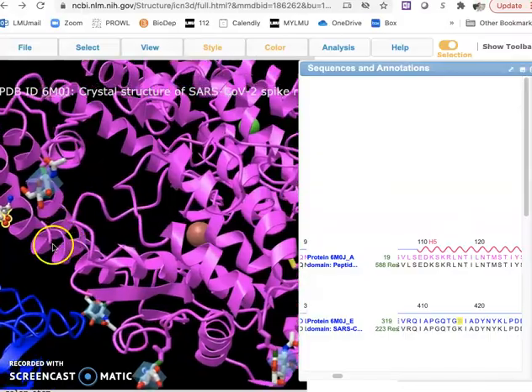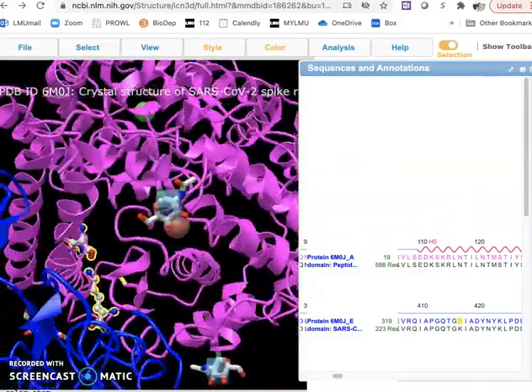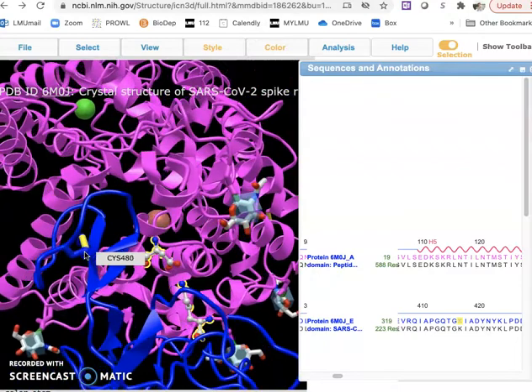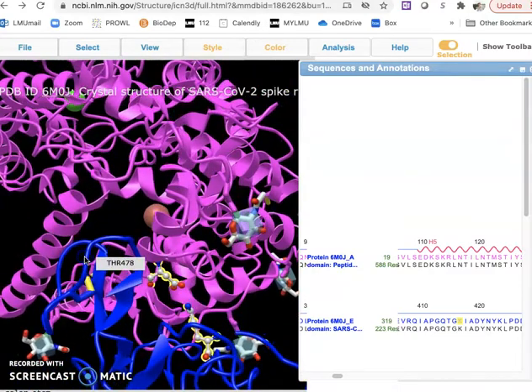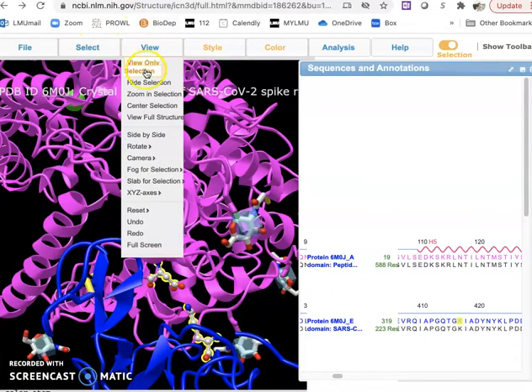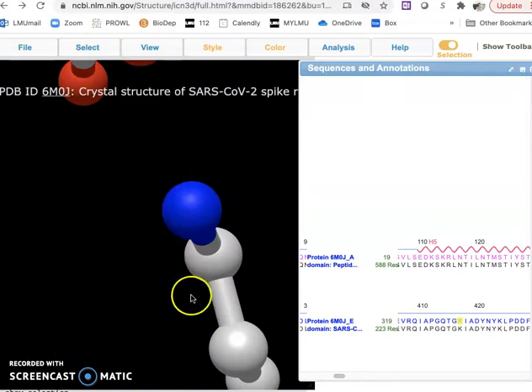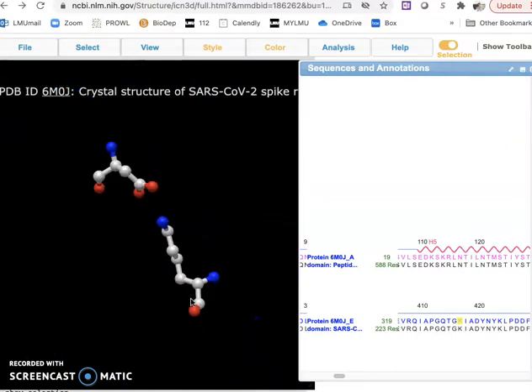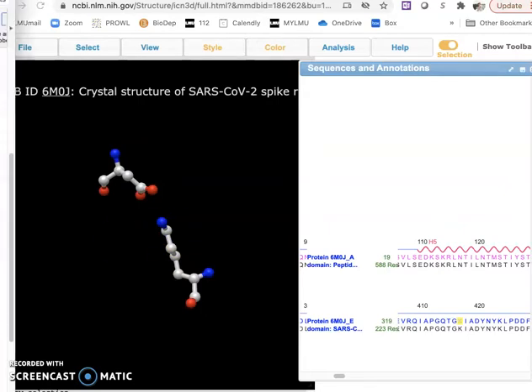I have a feeling I could see it well for myself, but if I just want to visualize two molecules without anything else in front or behind it, I can say view only selection. I would have to probably zoom out a little bit, and I can only see my two amino acids interacting. I will probably leave it like this.